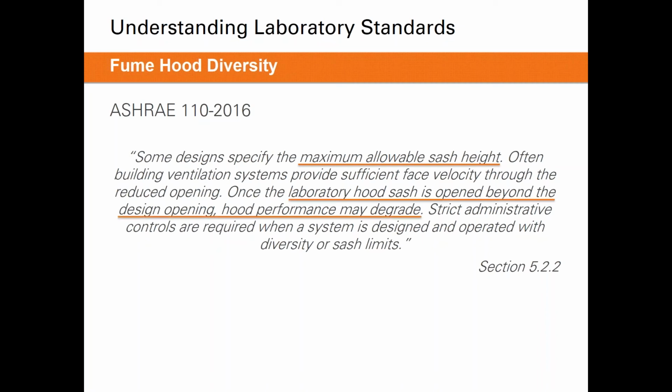Once the laboratory hood is past the design opening, hood performance may degrade in these scenarios. So we want to make sure that we impose and train our users to have administrative control and have a system in place to understand those limits and work within those limits.